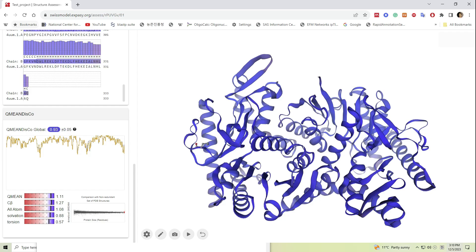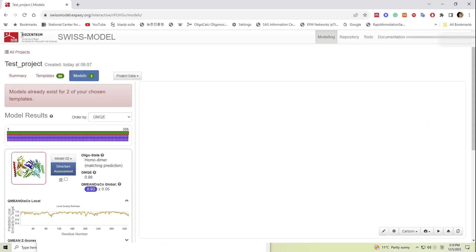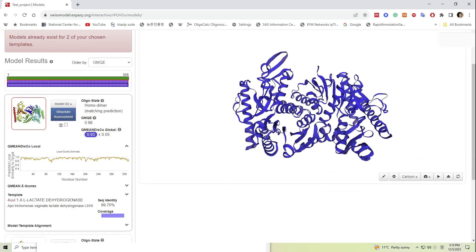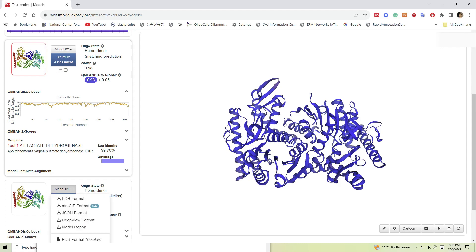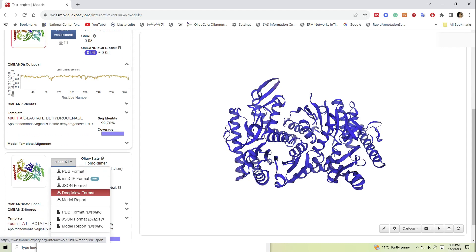Now let's go back to our model and we can now download our model in several formats, most preferably we use PDB format.